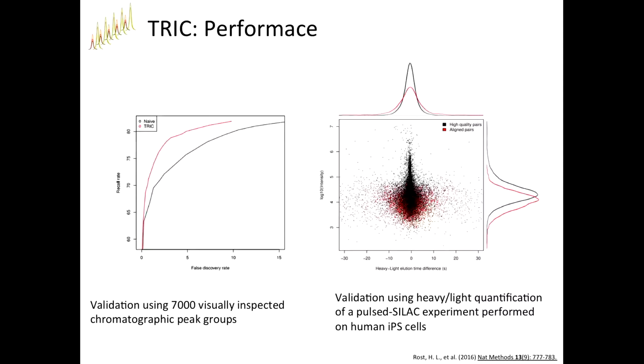Yeah, I have a question. We haven't done these exercises yet, but are these, I call it also a bit quality control plots, kind of standard outputs that we have in this lab when we execute, let's say, OpenSwath, and where this should be implemented, or how can we access and get this information that is so important for us to check? So you mean the discriminant score distributions and the p-value histograms? Yeah, exactly. So that we can get a clue what went wrong, or if we don't necessarily want to directly access the data in some different way.